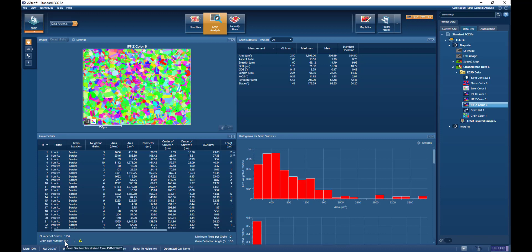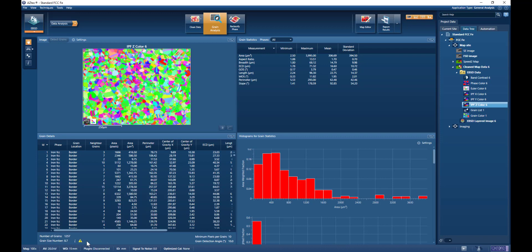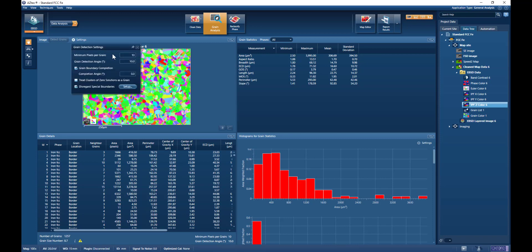Down at the bottom we see an ASTM grain size number of 8.7, and you can see that's the ASTM E2627 grain size standard. The exclamation mark here warns us that that particular standard requires that the minimum number of pixels per grain should be more than 100, and we have set it in the settings to be more than 10.